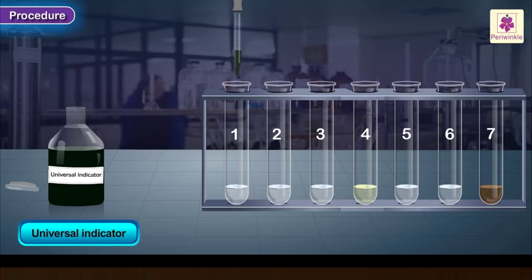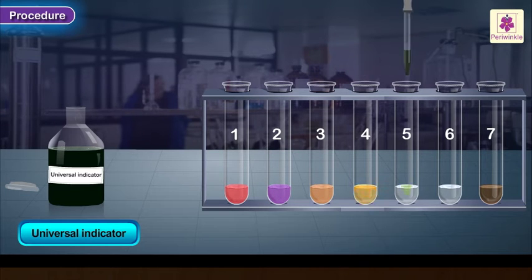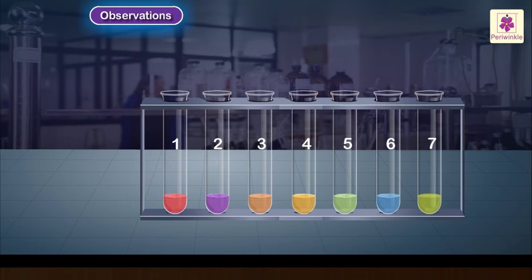Add one drop of universal indicator to each test tube. Observe and record the changes in the color of the contents of each test tube. Match the color obtained with that of the color chart to obtain the pH value of each test solution, and record the pH value observations.